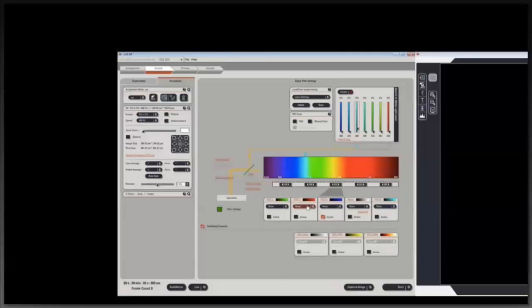For today, we're just going to use the normal PMTs, and as you can see, PMT3 has just been highlighted automatically, so I'm just going to untick it, and we're going to use PMT1. This is what I'm moving here. This is our emission collection band. So by highlighting PMT1, this is the band that we are going to collect our emission in.